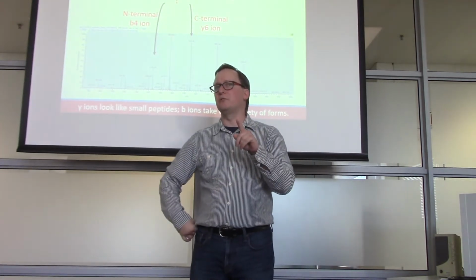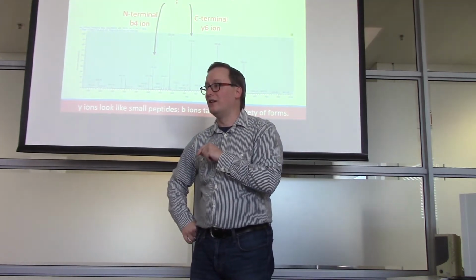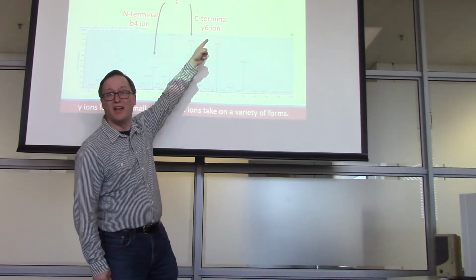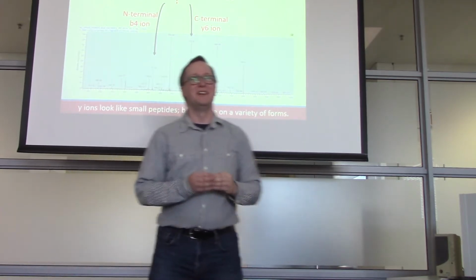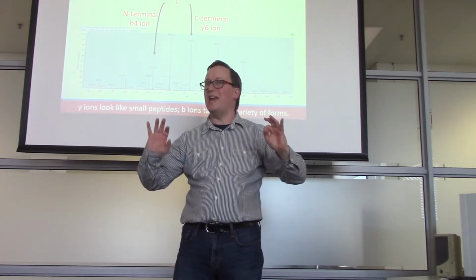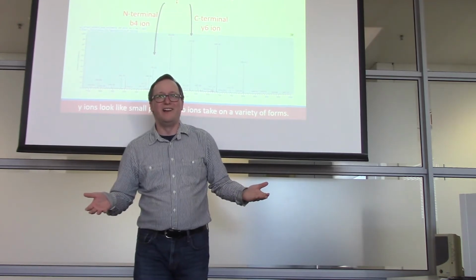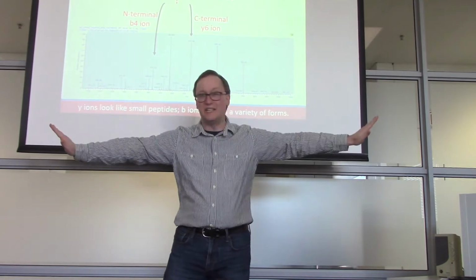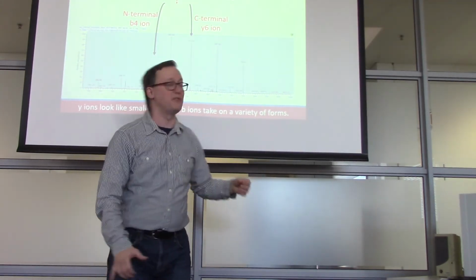What did I say about trypsin? What did you tell me about where it cuts? Arginine and lysine. At the C-terminus of this peptide, we have a? Lysine. Lysine, very nice, yes. So don't be confused by the K. K is lysine. What is L? Leucine. Leucine, lysine, completely different in their behavior. So here we got our lysine on the C-terminus of a peptide.